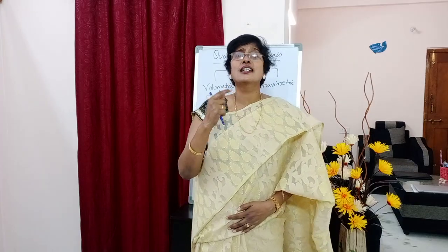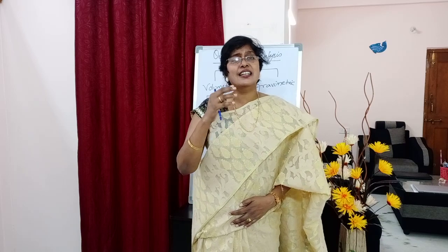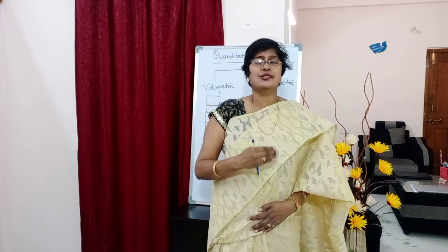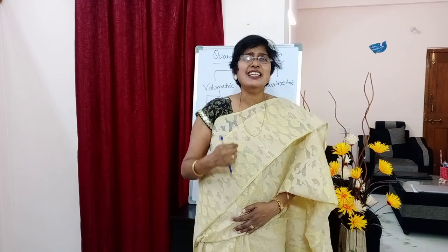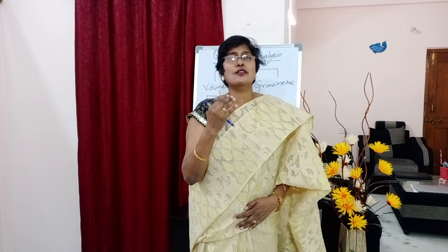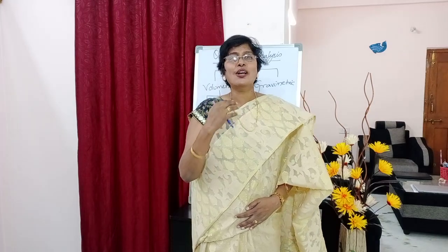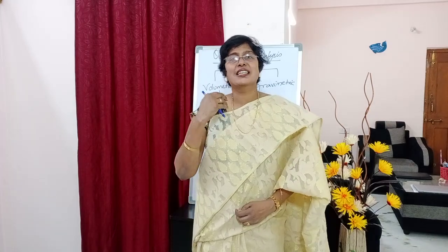And students, one more thing I want to remind you, this theory of quantitative analysis you have already studied in your first year, that is in general chemistry. So now doing the experiments and learning the experiments under quantitative analysis will be very easy for you. My sincere suggestion is take the books of first year and kindly refer to quantitative analysis once. Okay, then what I am explaining now will be easy for you.